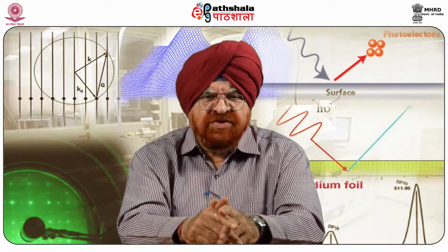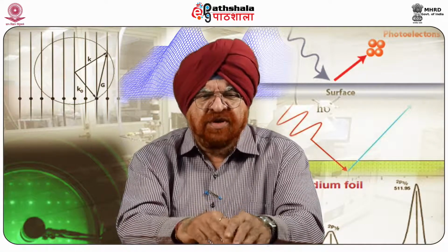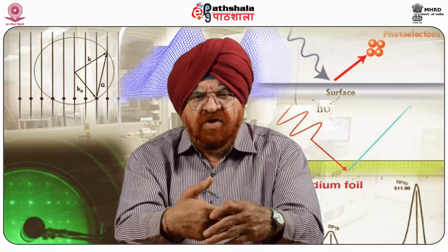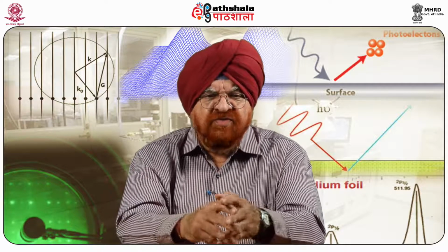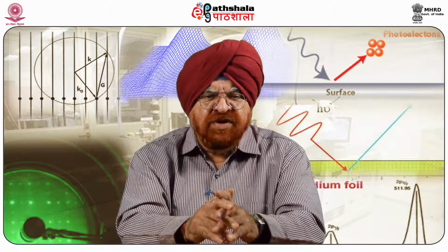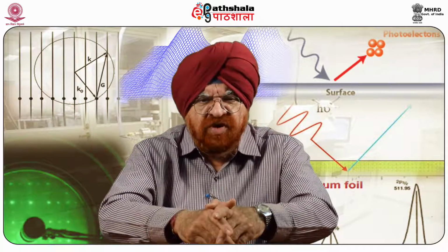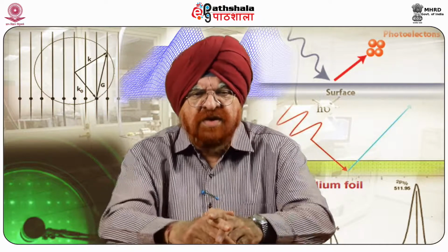Now, when we introduce this, we realize that scanning probe microscopy is a branch of microscopy that forms images of surfaces using a physical probe that scans the specimen. It is one of the powerful modern research techniques that allows us to investigate the morphology and the local properties of the solid body surface with high spatial resolution. The first scanning probe microscope was invented in 1981 by Binnig and Rohrer.